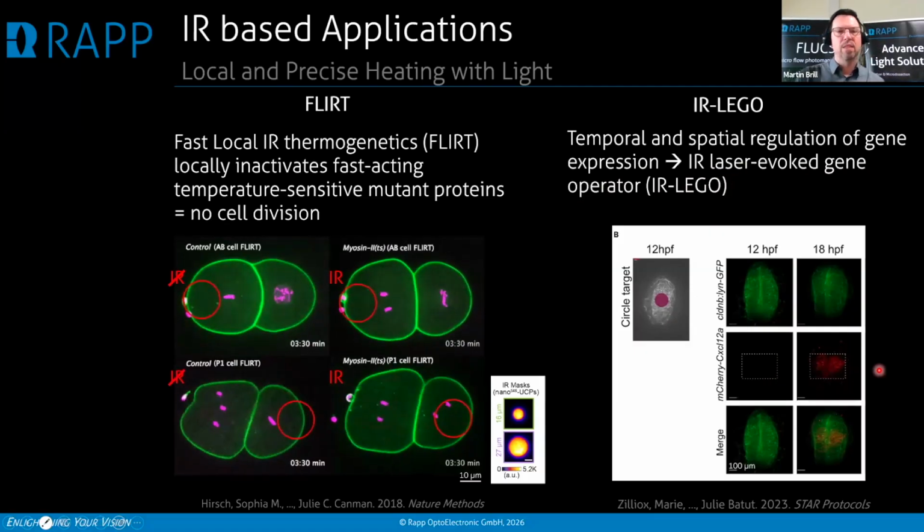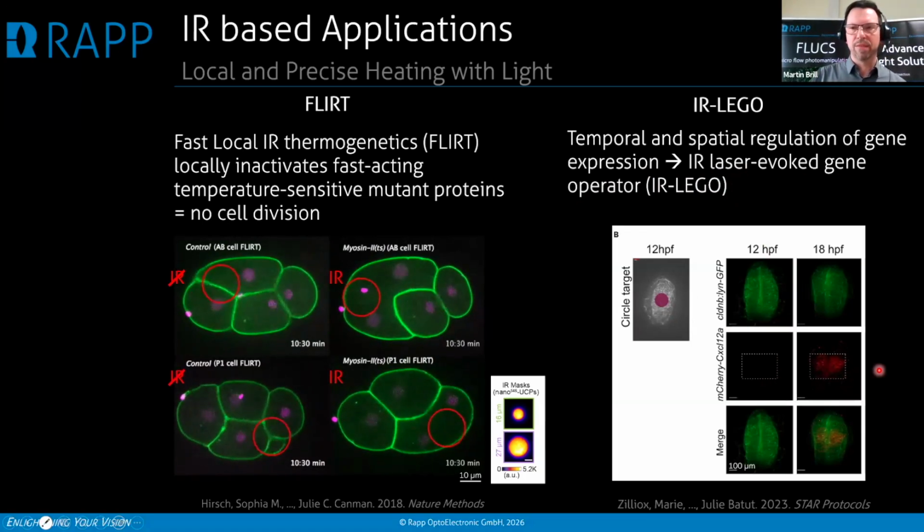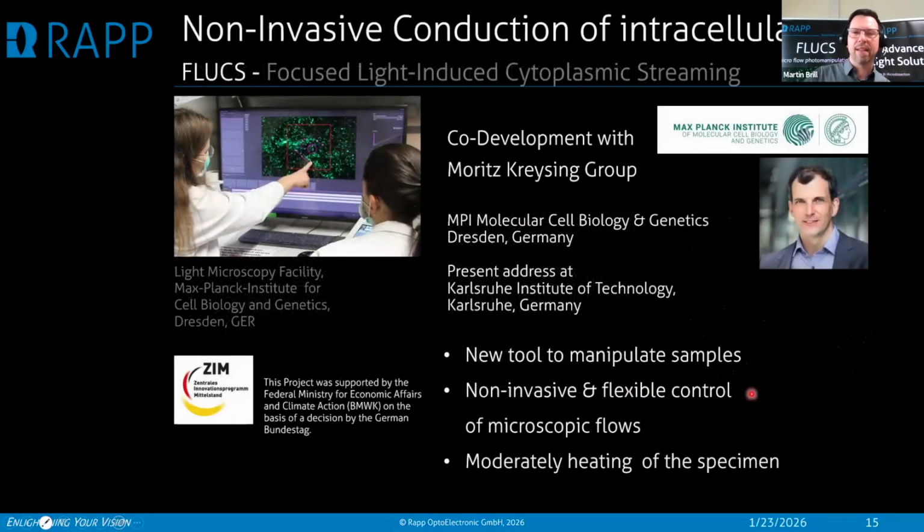In the IR field, we also have a new device I would like to give some insight into, which works also with IR lasers. We call it flux focused light induced cytoplasmic streaming. It makes these beautiful images if you do a long time recording. This was done in an endeavor together with Moritz Kreising and his group as a co-development, as he was at the Max Planck Institute for Cell Biology and Genetics, also together there with the light microscopy facility.